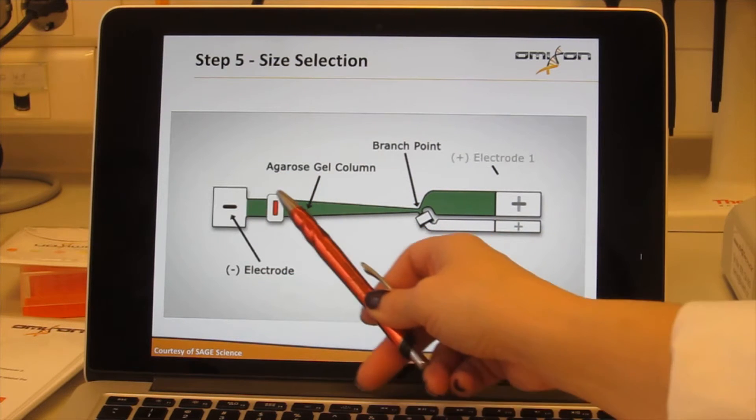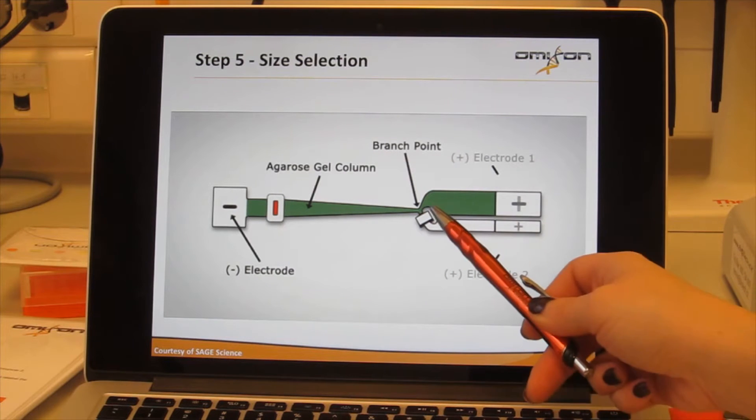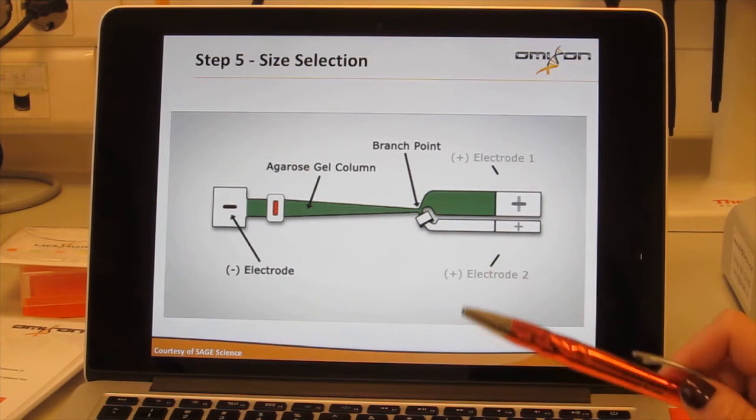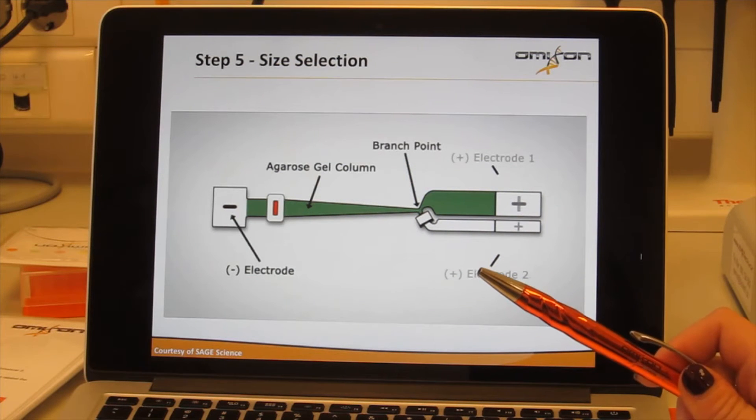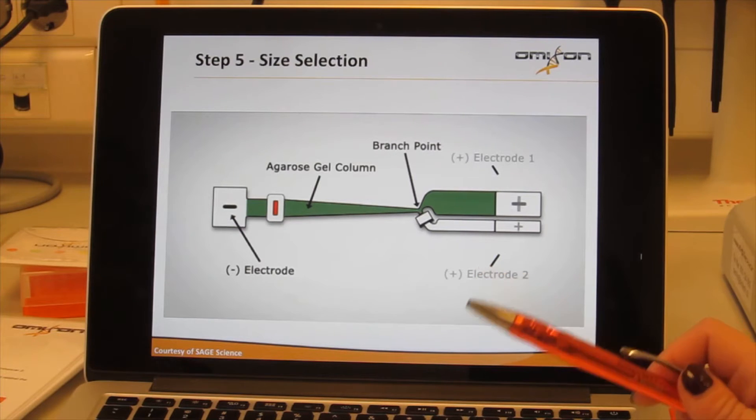There is also a loading port right here where the red is. That's where we load our library, and then there is a collection chamber on the side on the branch with no agarose, and that's where the library gets collected after the size selection.